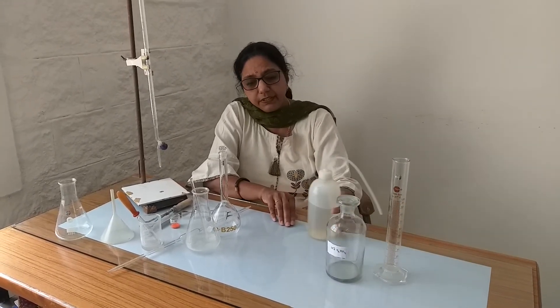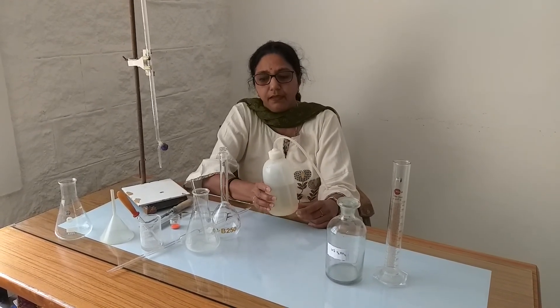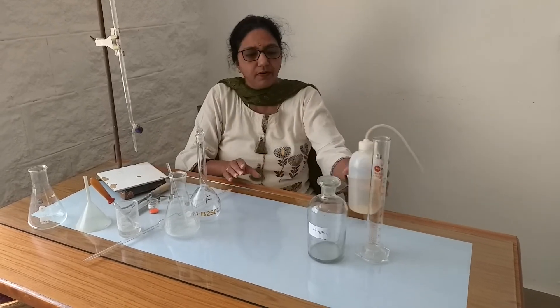A very important part of the lab is the wash bottle. These are made of plastic and have a body with a long plastic tube. If we squeeze this bottle over a beaker or a conical flask, we can dispense water by squeezing it. These are all the glasswares generally employed in any lab, and especially the chemistry lab.